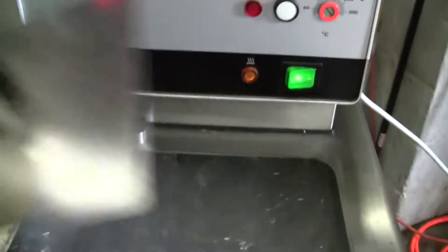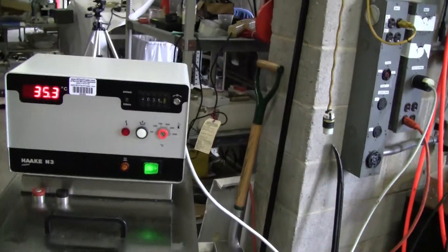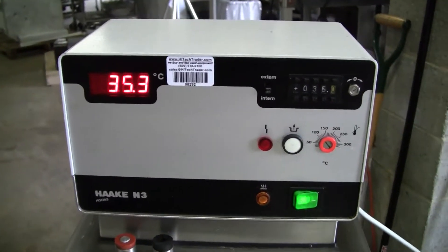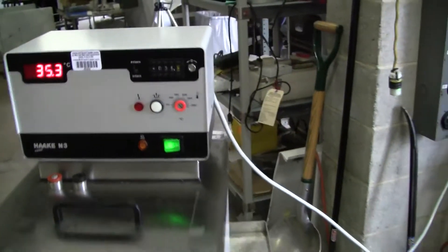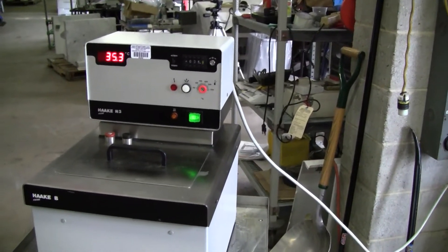We're running out of water right now. It's currently set at 35 and it's held at 35.3. It's got a high temp of 300 degrees C.